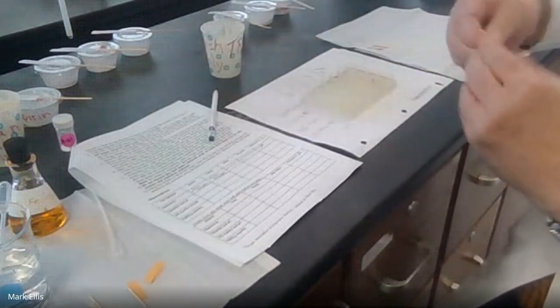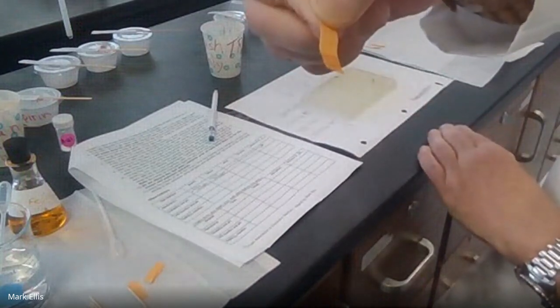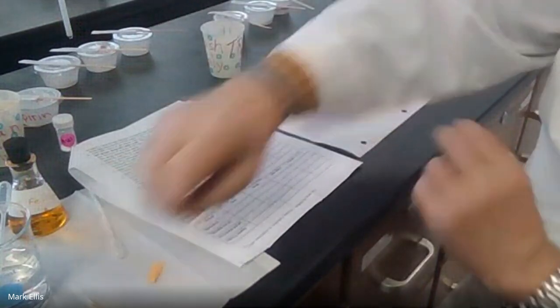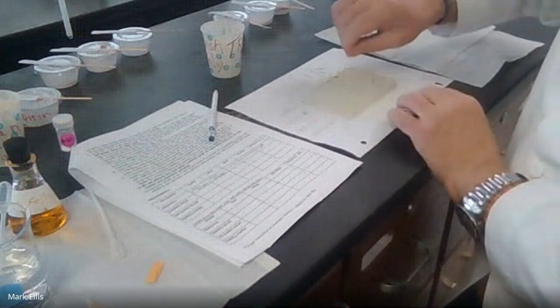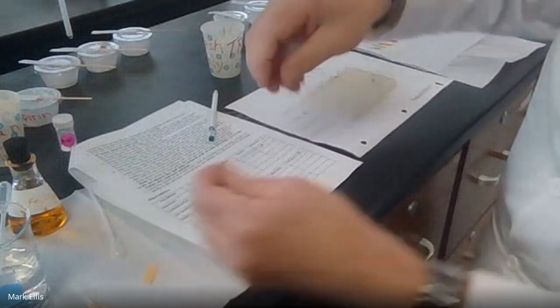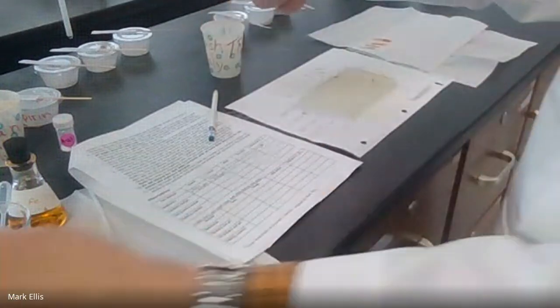So if I had a lab partner, they could be getting them ready for me. So there's 3, that's neutral. And 4th column, tap, that's red, that's acid. And for my unknown, dip it in, that's kind of reddish and that's acid.